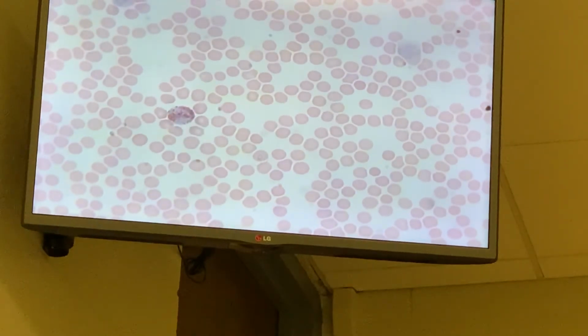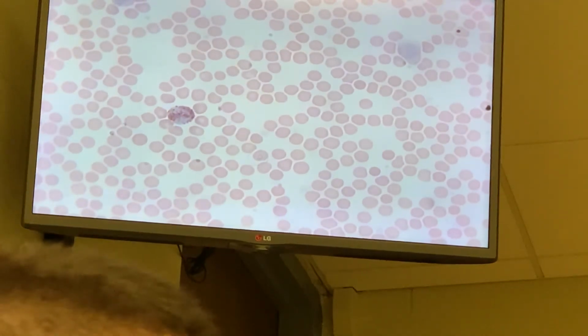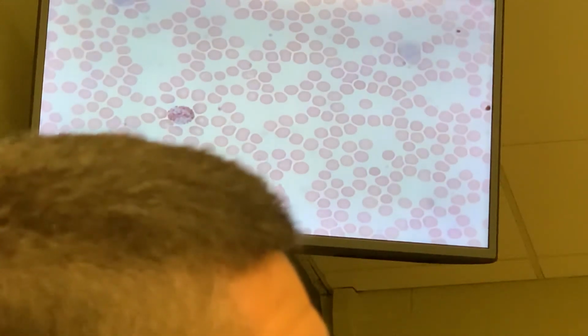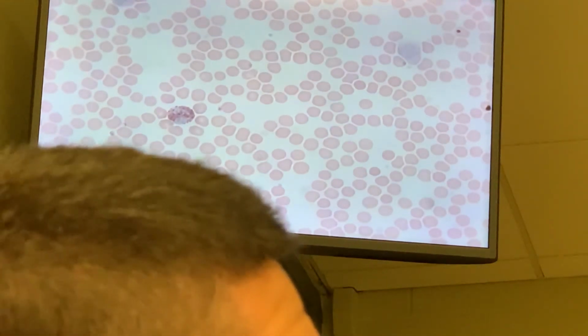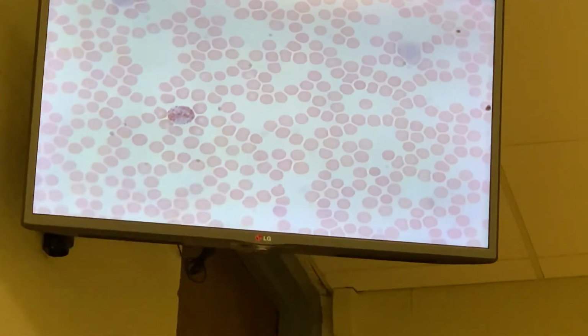Can you see that? Looks like it. No, neutrophils definitely don't look like that. I can show you another neutrophil. Is the one on the top right a monocyte? The top right, it's pretty dim. Oh, this? Yeah, no, I think that's artifact. It'll be a little bit more obvious. No, neutrophil, the nucleus looks different.